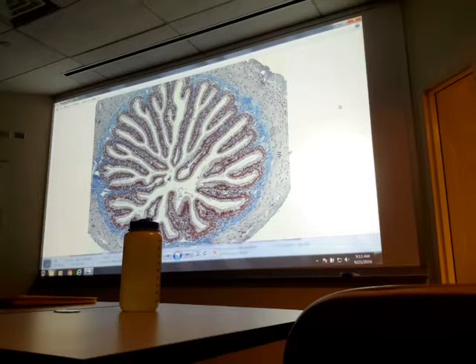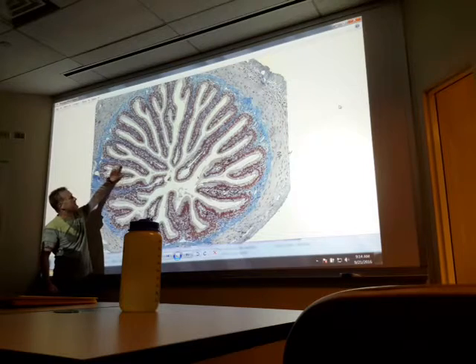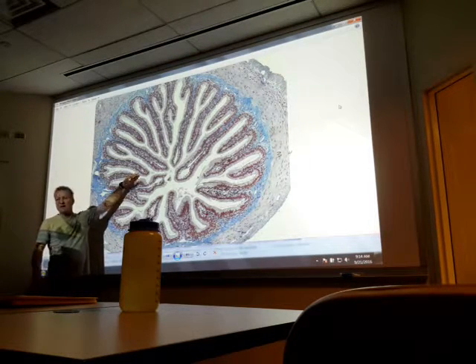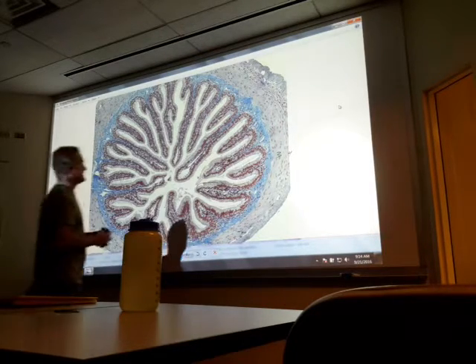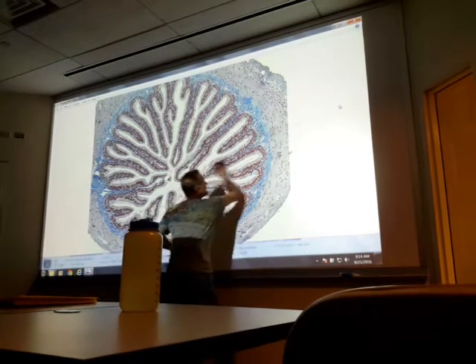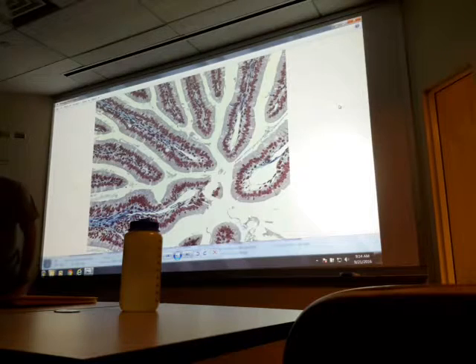The lining is primarily the simple columnar, but you've read about different types of cells. For example, is there a type of cell in this simple columnar that secretes something? What's the name of that cell and what does it secrete? Goblet cells, and what do they secrete? Okay. So you've no doubt read about this in the supplement, or on the DVD. There are different types of cells. It's not pure simple columnar. The small intestine is all about absorbing what you eat. So we'll talk about that, and we'll blow this up gradually.